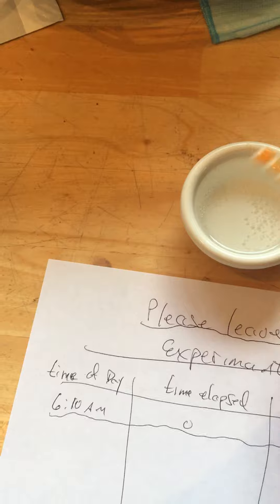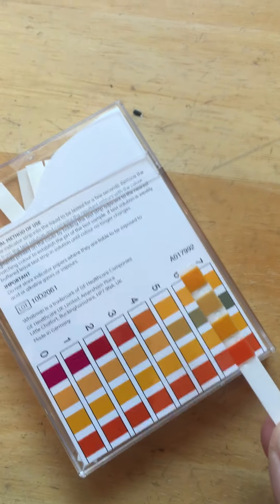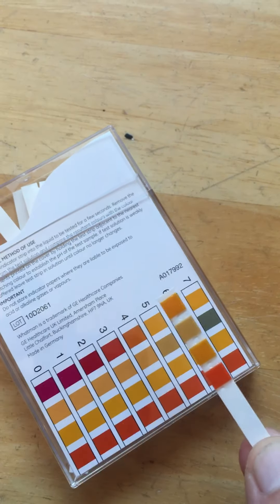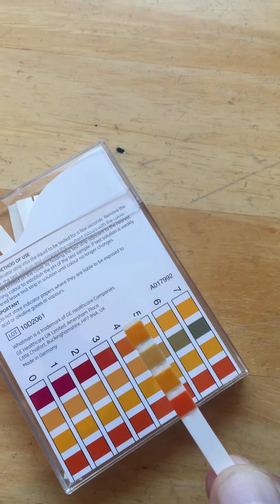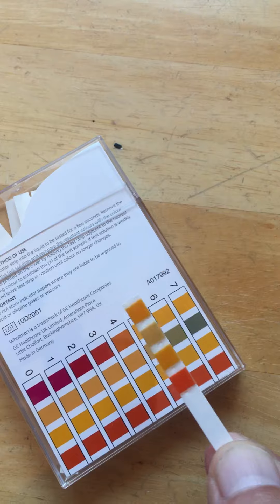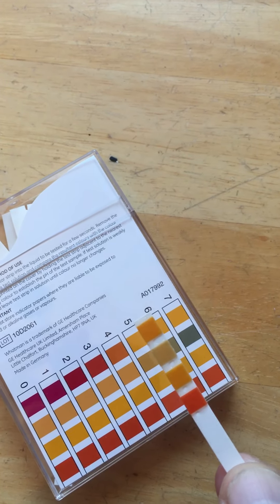Wipe it dry. Probably hasn't changed very much. You can see it looks right about the same, maybe pH 5. So we're going to say it's pH 5 still.